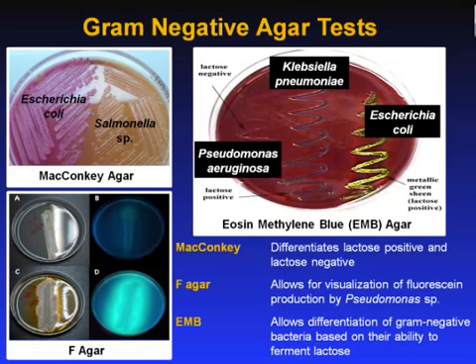By utilizing the lactose available in the medium, lac-positive bacteria such as Escherichia coli, Enterobacter, and Klebsiella will produce acid, which lowers the pH of the agar below 6.8 and results in the appearance of pink-red colonies. Non-lactose fermenting bacteria such as Salmonella, Proteus species, and Shigella cannot utilize lactose and will use peptone instead. This forms ammonia, which raises the pH of the agar and leads to the formation of white or colorless colonies, or appear the same color as the medium. Some organisms ferment lactose slowly or weakly and are sometimes put in their own category. These include Serratia and Citrobacter.